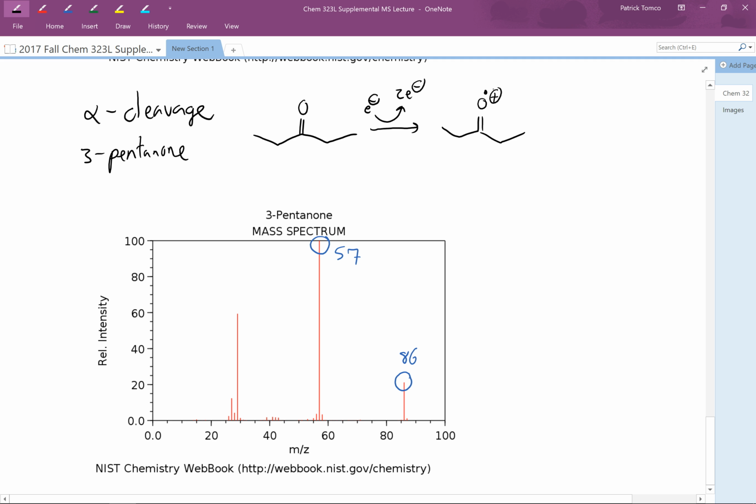Now we're going to see that this compound can fragment according to the structure of the molecule. Now this is a radical, there is a cation, and so I can actually break those bonds here at the alpha position. I can break with one electron from that bond going into the oxygen. One electron from the radical of that oxygen can come together. What this does is form a triple bond between the carbon and the oxygen, and it breaks the carbon-carbon bond at the alpha position. So I want to draw the structure of this molecule. I have now a triple bond between the carbon and the oxygen. I've retained the positive charge on that oxygen, and what I have left is the ethyl radical.